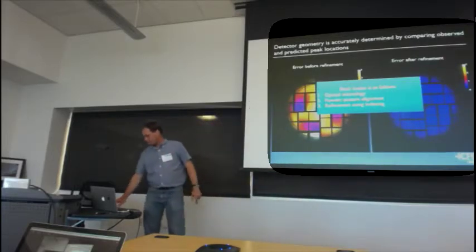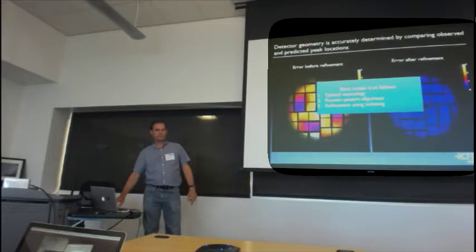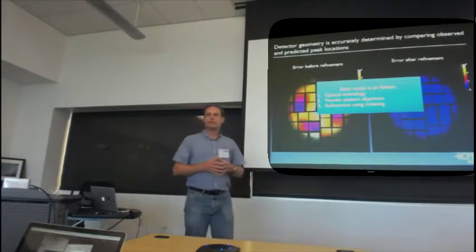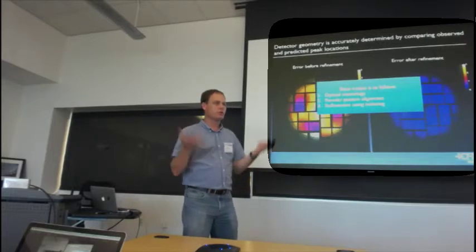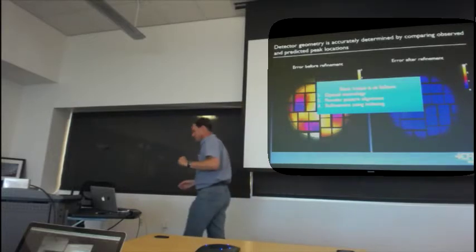Can you incorporate reference data into Cheetah to calibrate, for example, your resolution scans in angstroms rather than pixels? I mean, why do I do it that way? It's partly because we had problems with the detector encoders at some point, and if these things are not read out properly, you end up with really strange things. So it was easier just to do it in pixels at that point. Of course, you can put in a calibration, it's just a number.